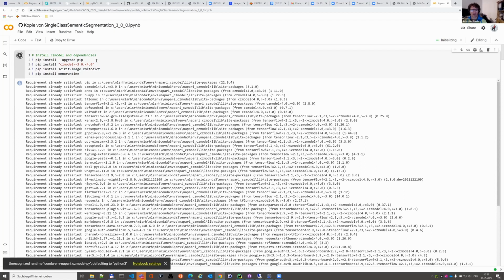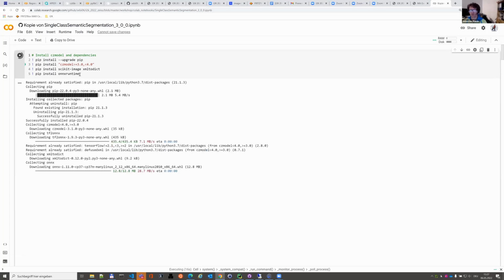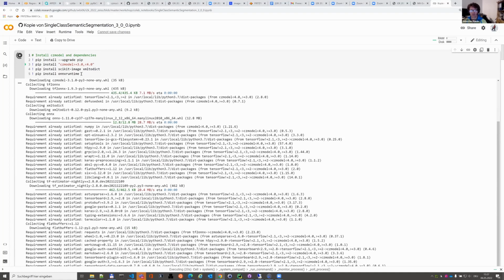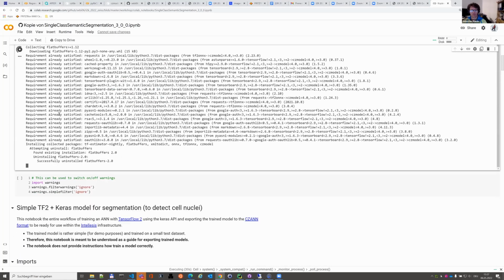Straightforward. Run the pip stuff. I will also install the ONNX runtime here to execute the model in the end. Little side note: at Zeiss, whenever possible, for execution of a model we use the ONNX format. It's way easier to manage in terms of GPU memory, in our opinion, compared to TensorFlow. Or we use PyTorch. Nevertheless, to execute it, mainly ONNX. Okay, it's doing all that stuff here, not so exciting.